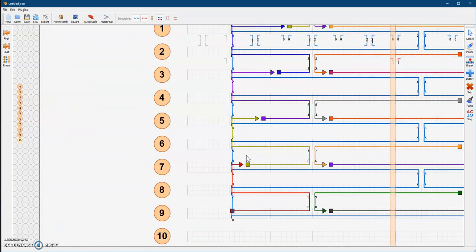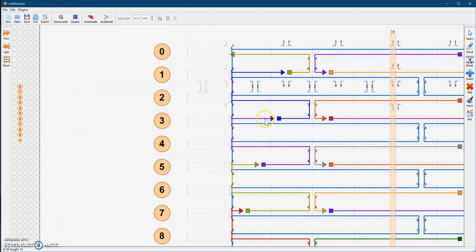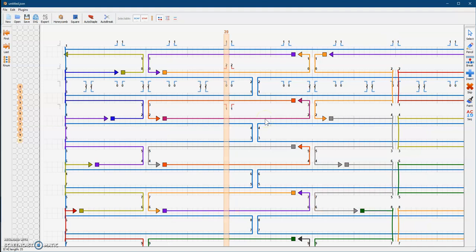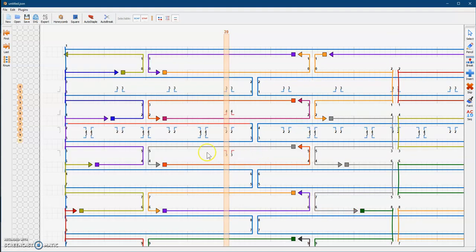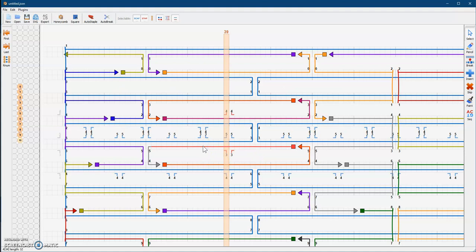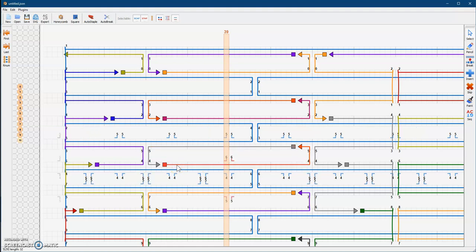We got very lucky — it looks like all our strands have a pretty good length. If you want to look at the length of a specific strand, make sure your strand is selected and click on it. Or let's look at this gray one right here. We click on it, it highlights it. It's actually not by clicking — just mousing over it. If you look at the bottom left corner, you can see the length of whichever strand you're hovering above.